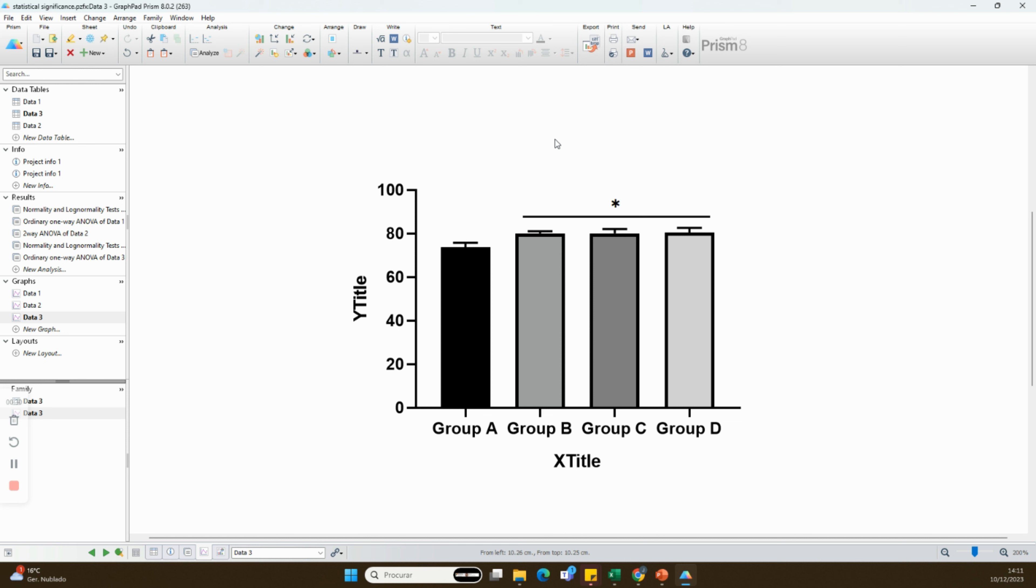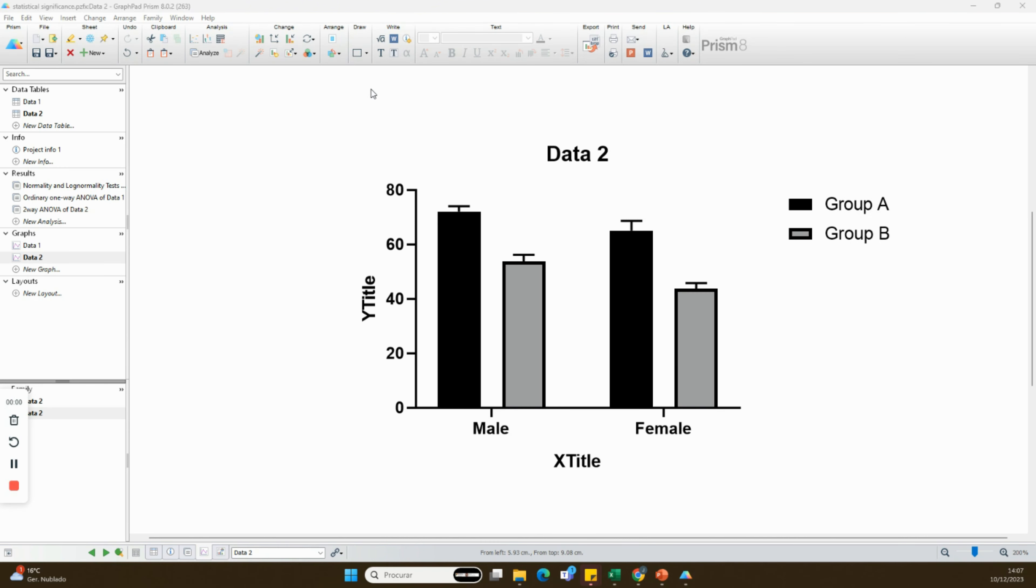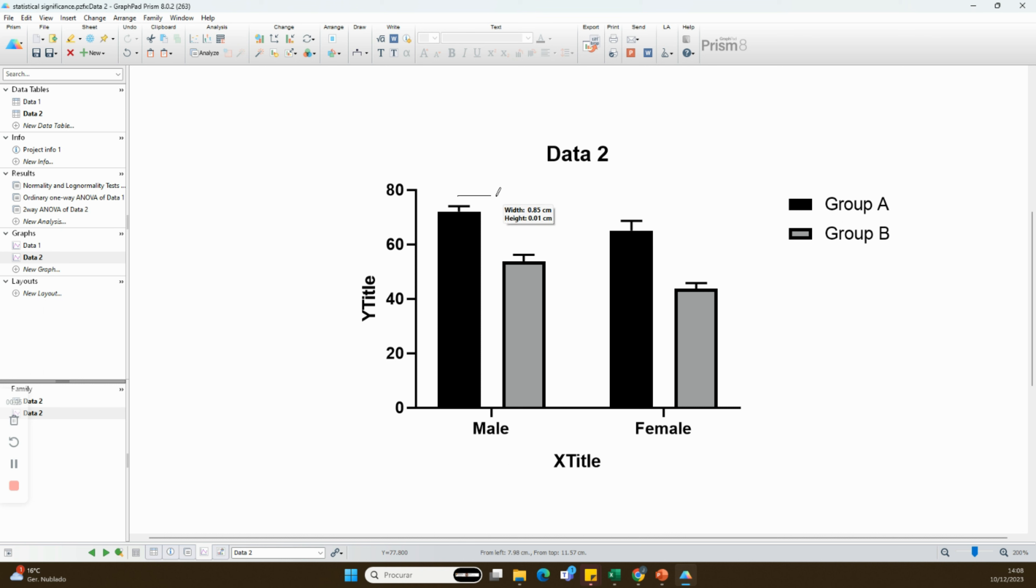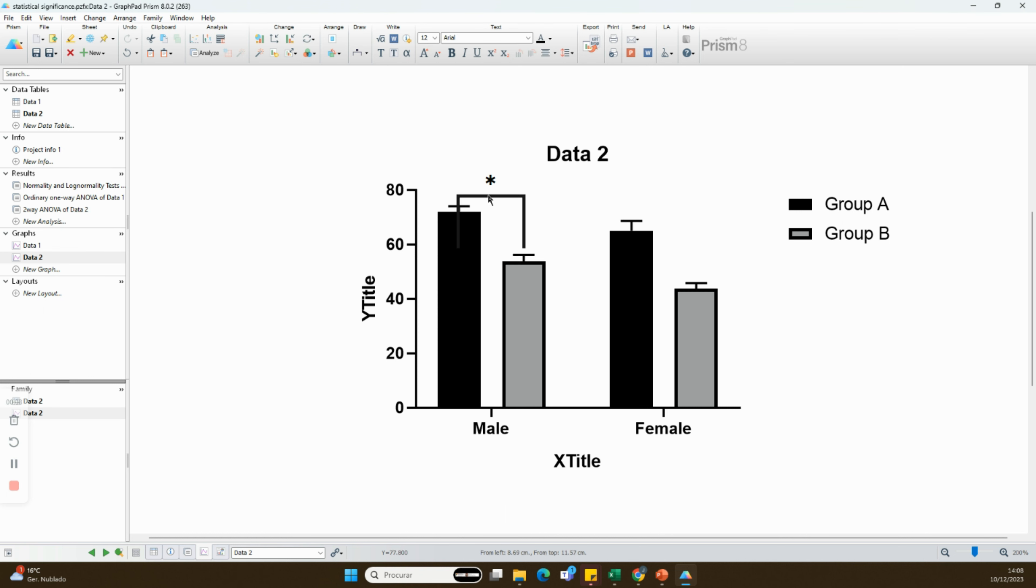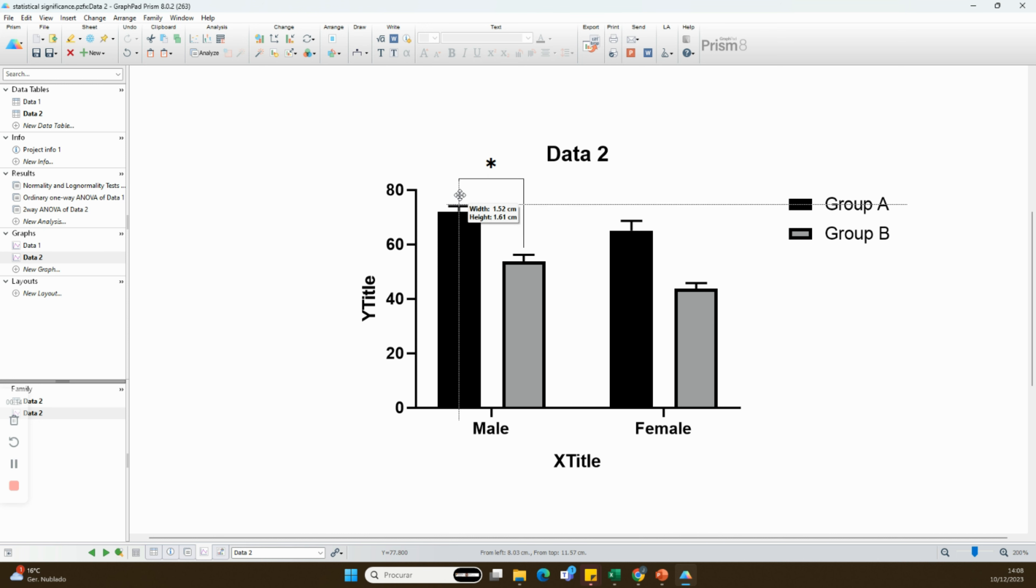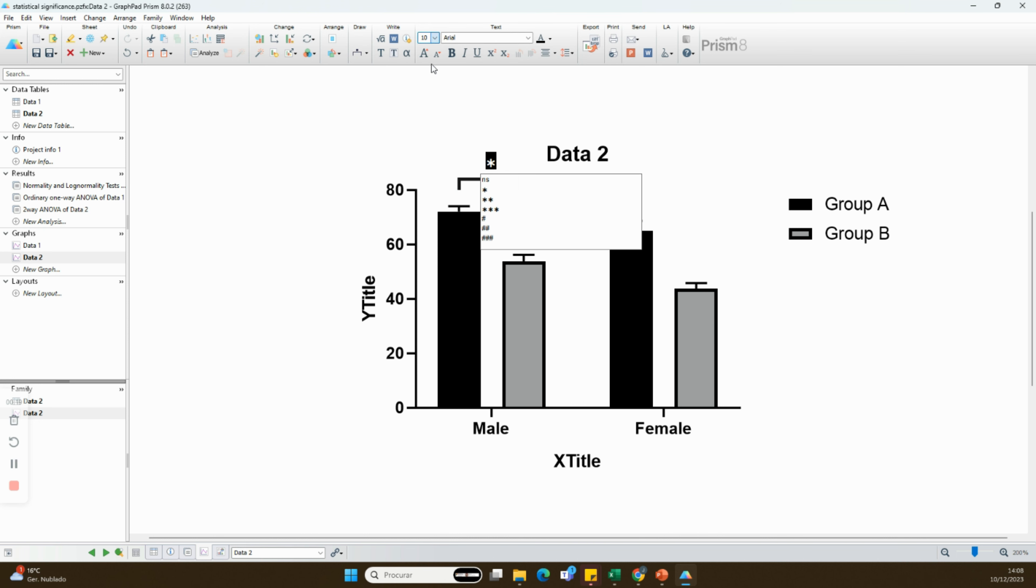In addition, when you have group data, instead of using different symbols, you can connect the groups that are statistically significant and use the same symbol above for every statistically significant difference.